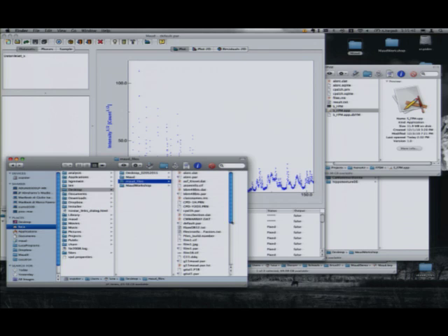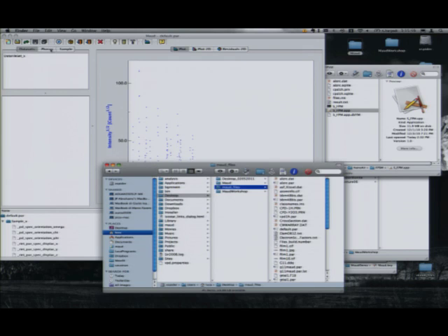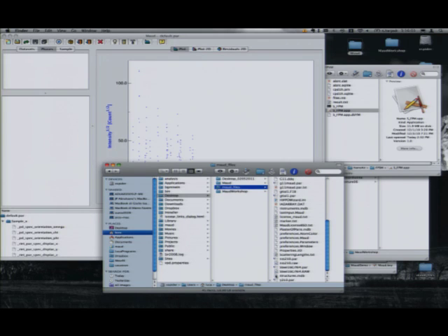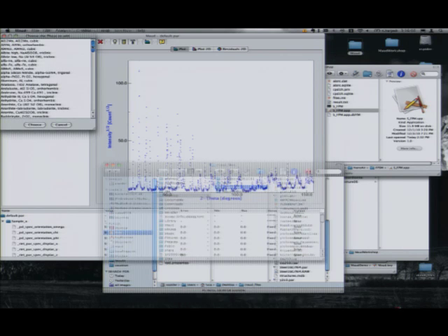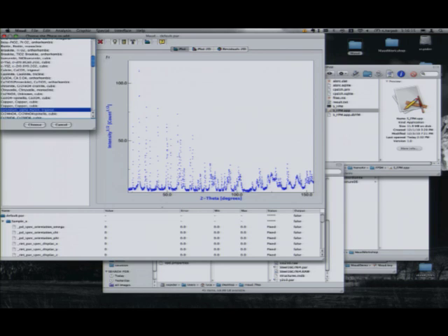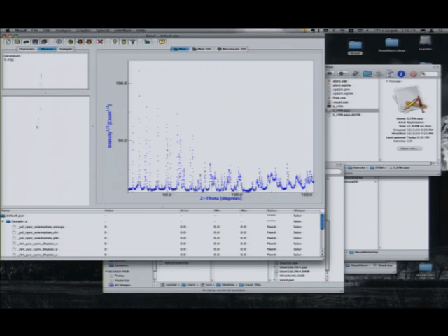So what you do is, I go to phases, and then I can use drag and drop for a zip file. The MAUD database is actually in zip format. It is structure MDB. So I drag over it, you open it, and you can store the phases you use most in there. Okay, corundum, where is it, here. And then I also want to load the tetragonal zirconia. It's just over here. So I load both, and I don't need to check if they are correct.